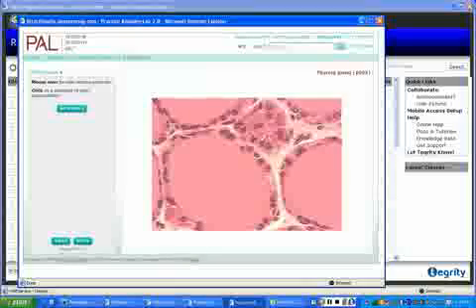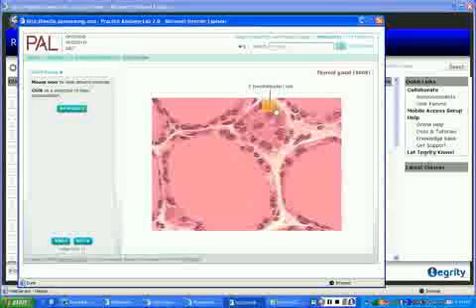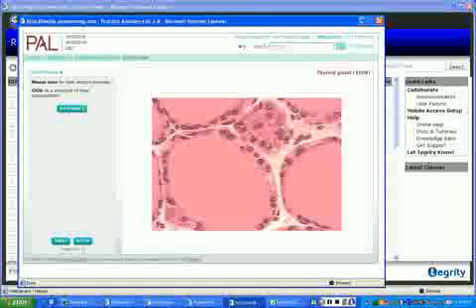Look. Aha! Look, no label. Oh, wait, one. They picked one. Parafollicular cell. But that is his buddy, and there's a little cluster of them. Little family. Parafollicular family. They're so cute.